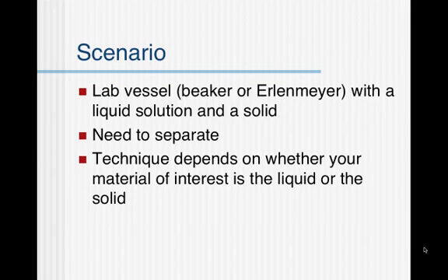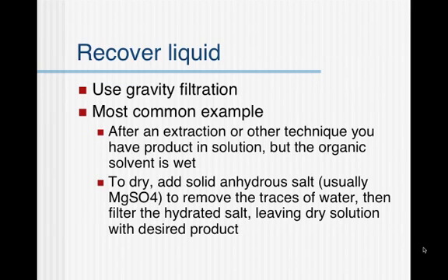In the scenario that is typical in the laboratory, you have a lab vessel, either a beaker or an Erlenmeyer flask, with a liquid solution and a solid, and you need to separate the two from one another. The technique you're going to use to do that depends on whether your material of interest is the liquid or the solid in your particular reaction. Oftentimes in lab manuals or experimental sections of papers, they'll say filter, and it is not necessarily clear which technique you use unless you think about the reaction that you're running.